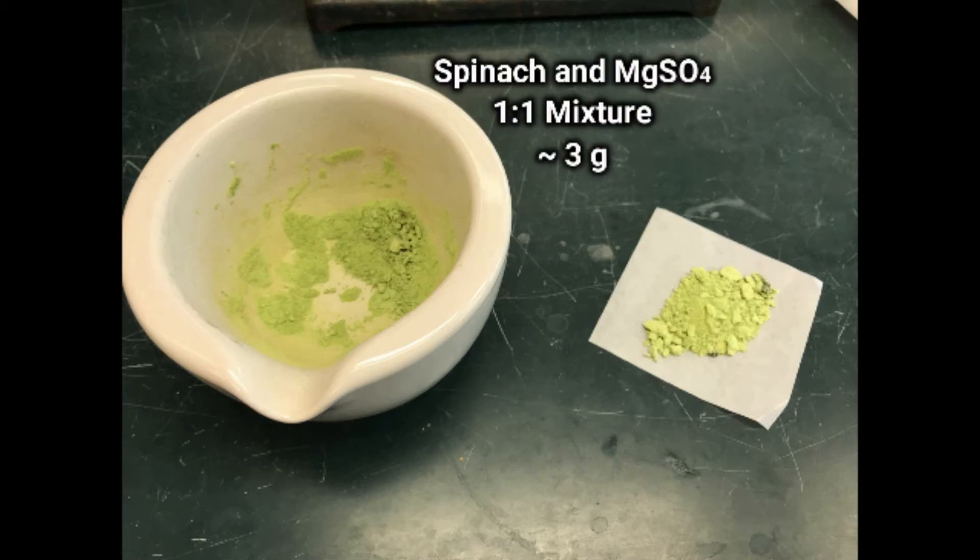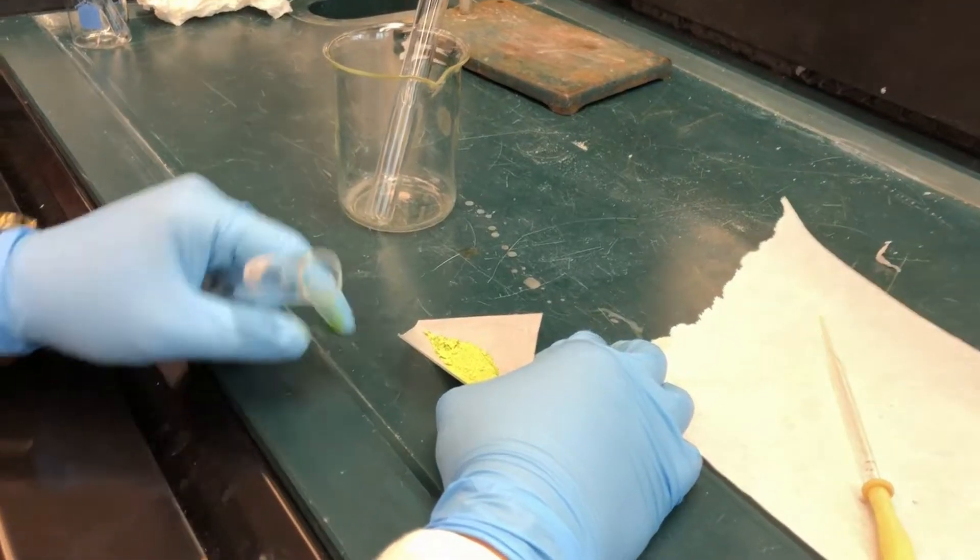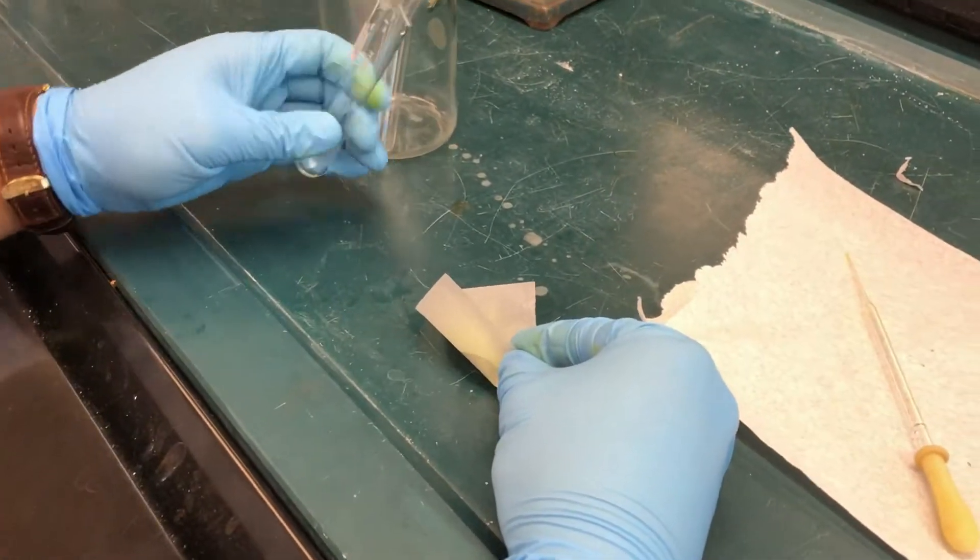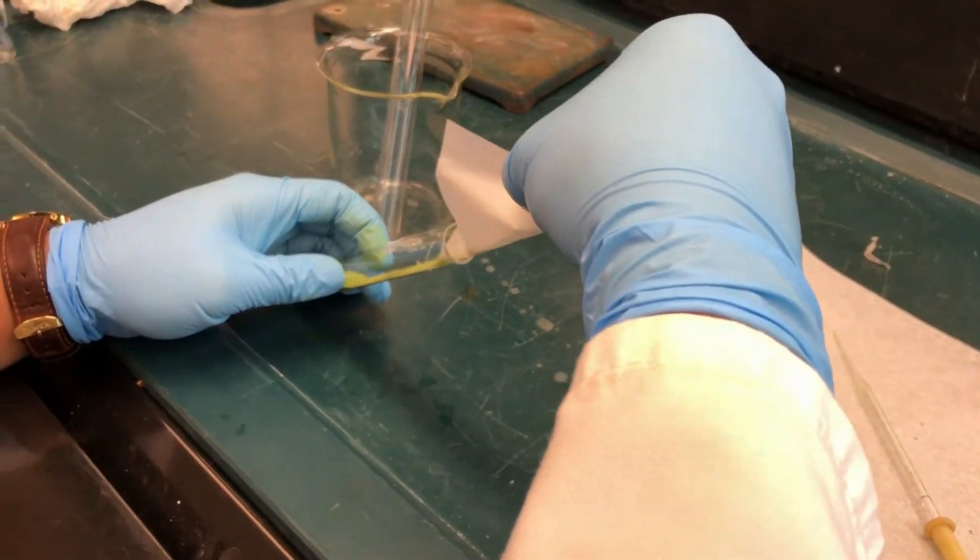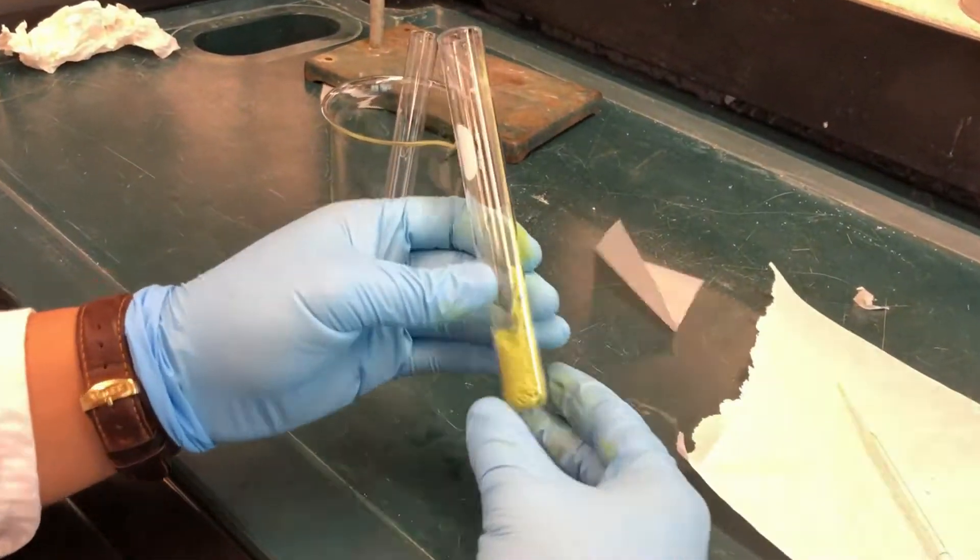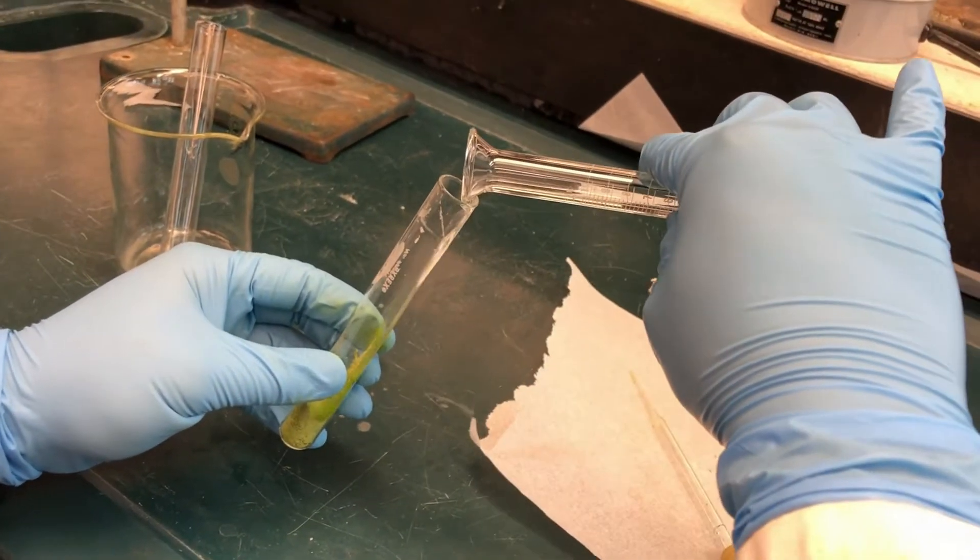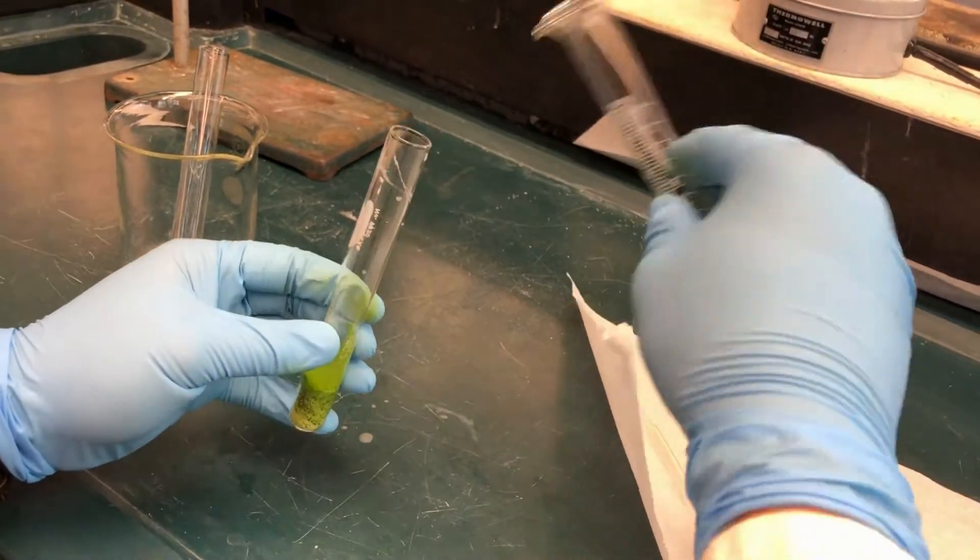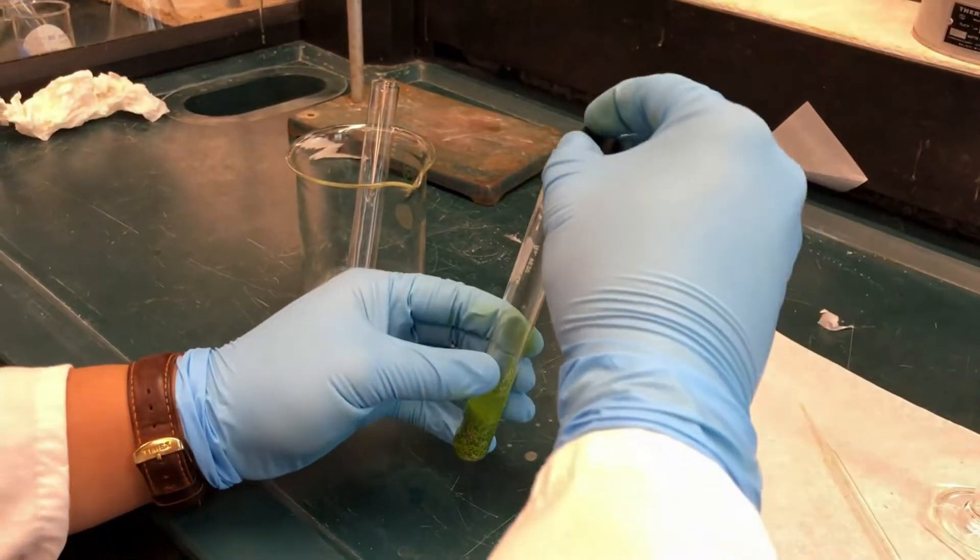Next, weigh about 3 grams of the spinach mixture and carefully add it to a small test tube. You can use a spatula or make a funnel from the weighing paper. Add 5 milliliters of acetone to the test tube and stopper with a silicone stopper.